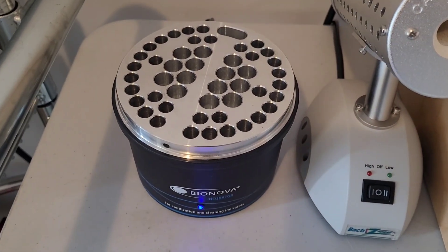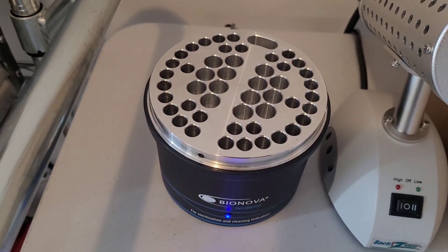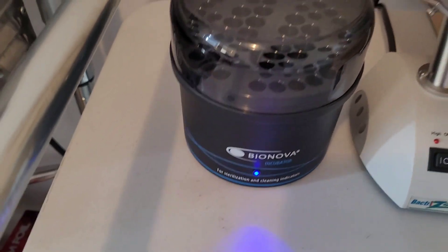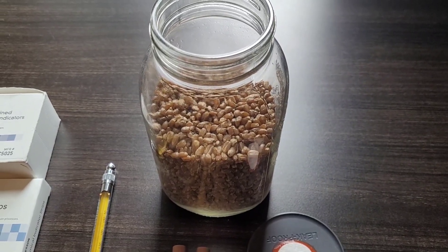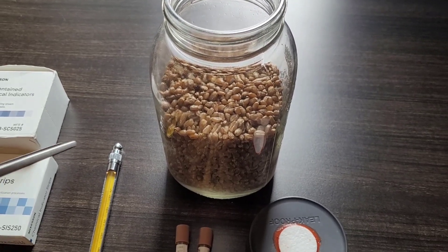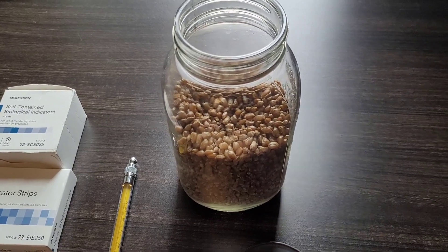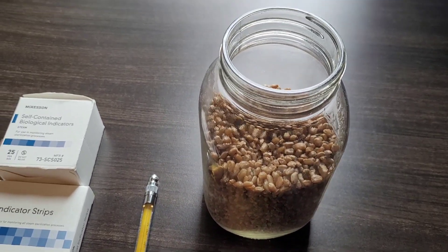These incubators run at 60 degrees Celsius and take about 24 hours to accurately get a reading on your ampules. The blue light indicates it's heating up, so let it heat up before running something. When selecting a load to cycle for verification, ensure the load is representative of what you would normally expose to your steam sterilizer of choice — in this instance, it's going to be a grain jar.